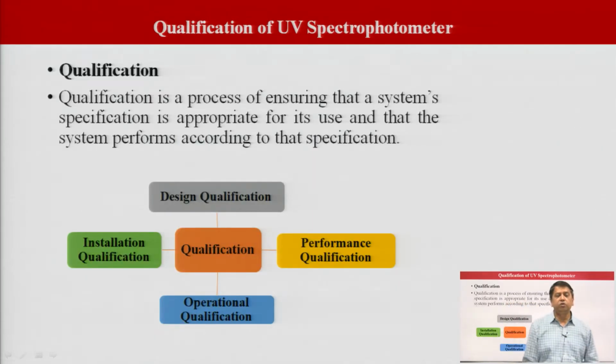So, now let us proceed to our core topic, that is qualification. Now, what is qualification? Qualification is a process that ensures that a system specification is appropriate for its use, and that the system performs according to that specification.